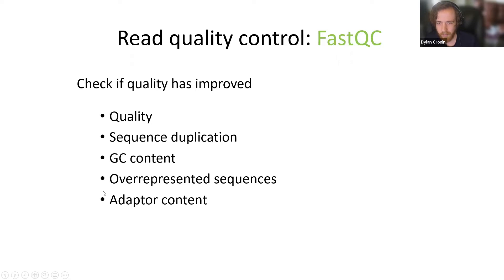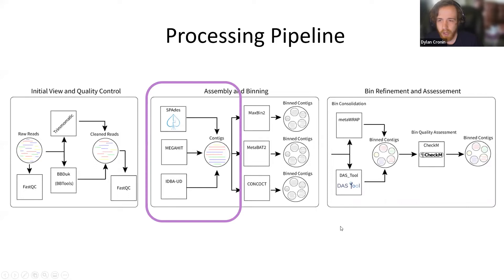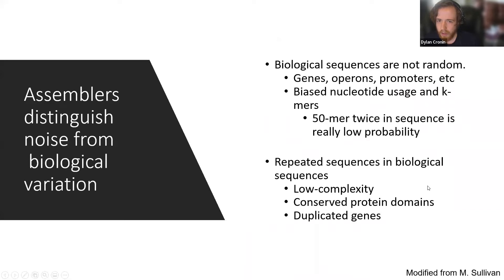You want to run FastQC before and after quality control. After running QC, you can see the average quality across the read is fairly high. With FastQC, check if quality has improved — look for average quality drops, sequence duplications, GC content, overrepresented sequences, and adapter content. These are some of the most important factors to examine.